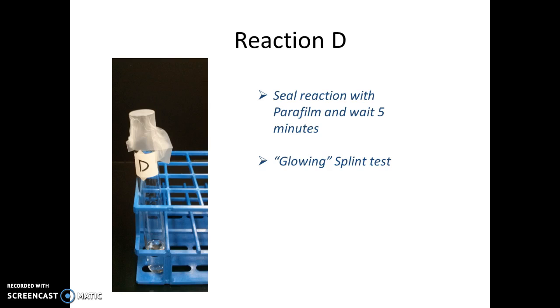We often do a glowing splint test when we're trying to test for oxygen gas. Oxygen gas supports combustion. It supports that flame at the end of your splint, and that's what we're testing for in reaction D.